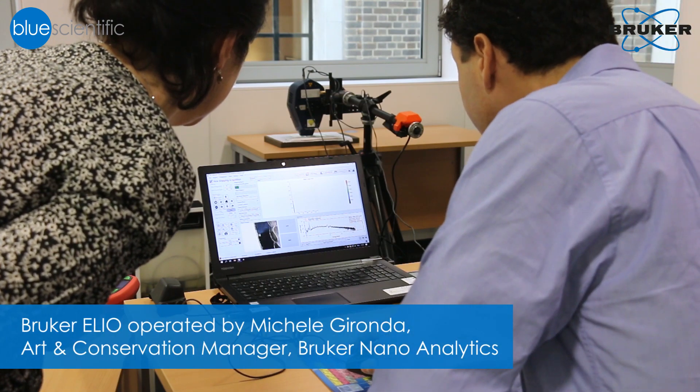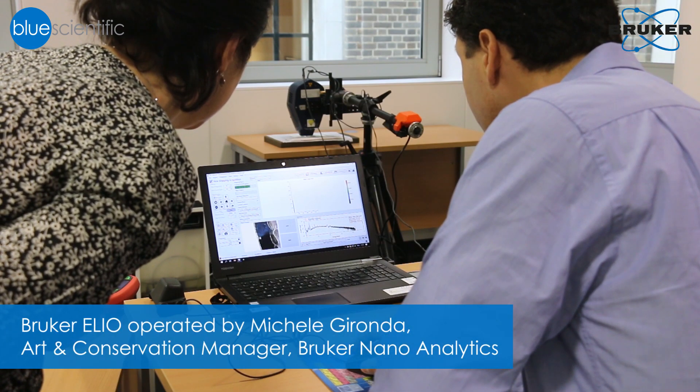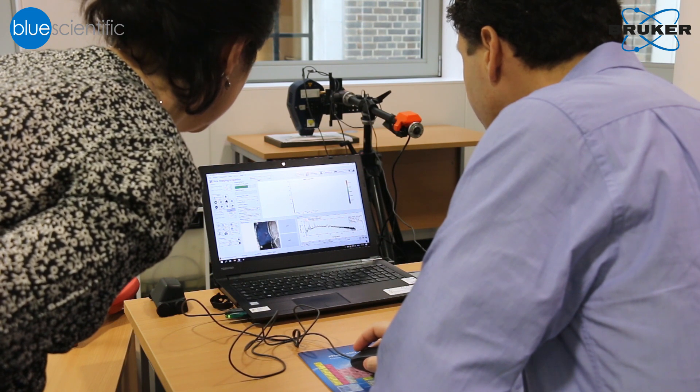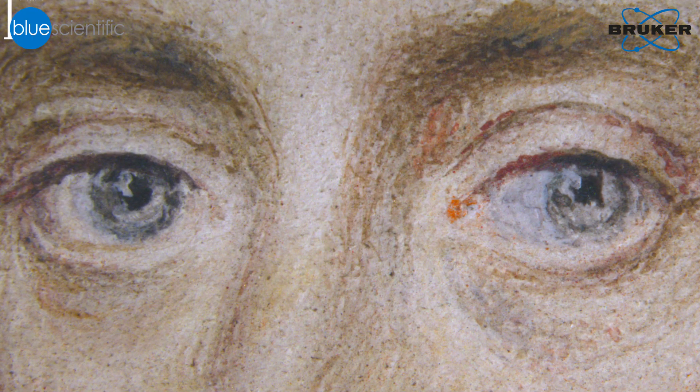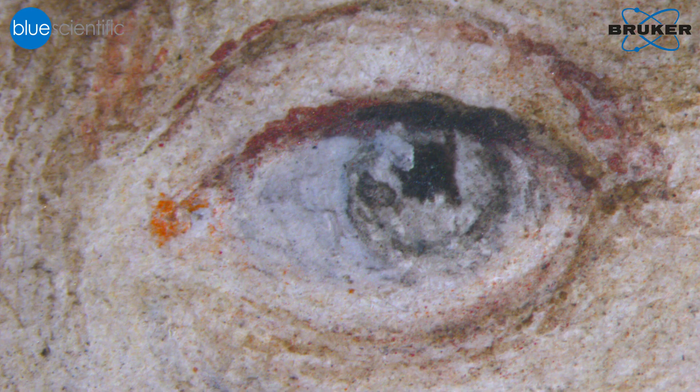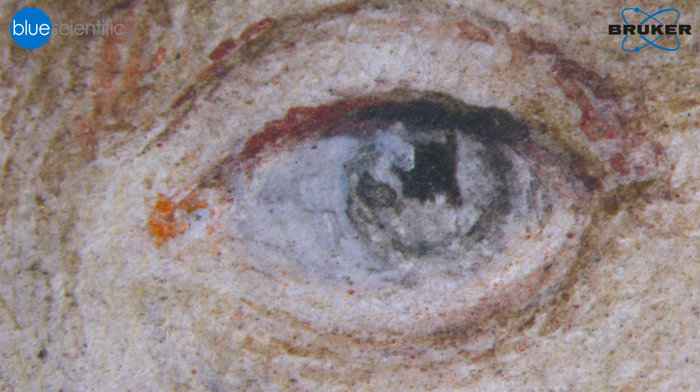We've been doing technical analysis with a number of different scientific methods, including various types of imaging such as near infrared and UV imaging, and very detailed photomicroscopy so we can get really high resolution details of the miniatures. This is really important because these objects are very, very small — usually only about 5 by 4 centimetres — so the details are so minute that it's really hard to appreciate them with the naked eye.